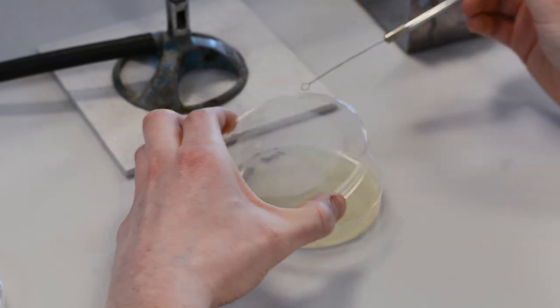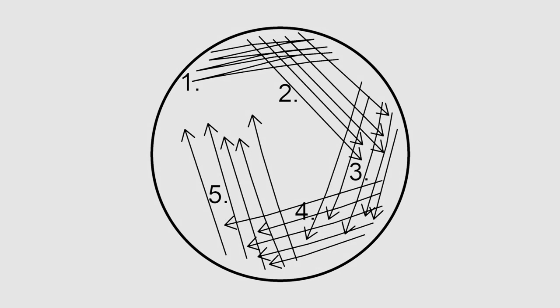Plates are usually kept close to the Bunsen burner flame as you work with them. This minimizes the possibility of unwanted microorganisms or contamination.